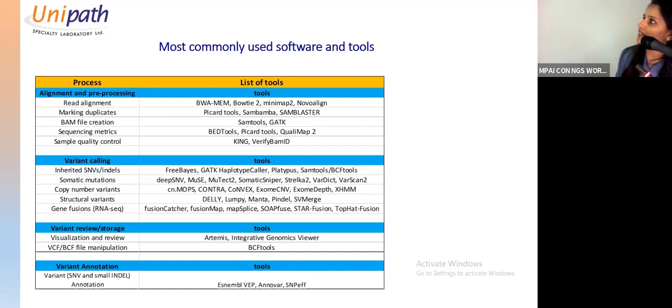Now this is sequencing metrics. After you get the BAM file, it is also big, because when you have millions of reads, it is a representation of millions of reads along with the reference genome. So how do you check the quality? For FASTQ sequences, you use the FastQC tool, right? Here are a number of tools which give you an overview in a beautiful graphical way of the insights you consider while sequencing, such as how reads are mapped. All the metrics you get from here, using this type of tools.